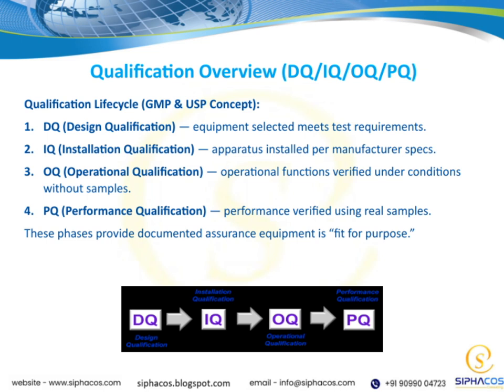Next, we have installation qualification, or IQ. Here, we verify that the equipment is installed correctly, following the manufacturer's specifications. This step is crucial because proper installation sets the foundation for all subsequent validation activities.